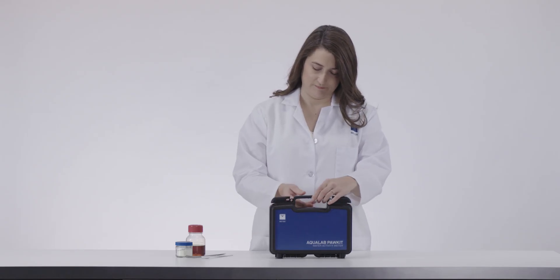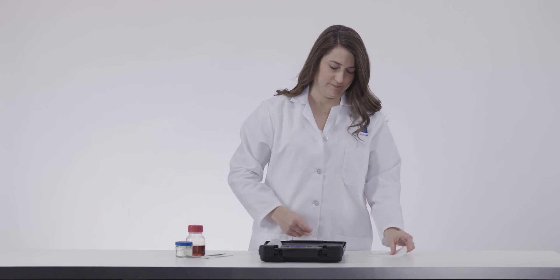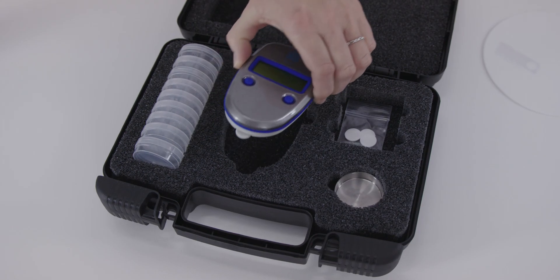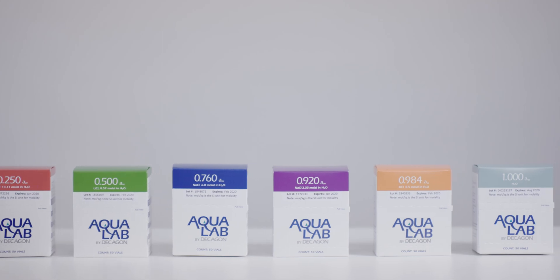If the sample chamber or sensors become contaminated, your pocket will not measure water activity correctly. The best way to check for contamination inside your instrument is by running verification standards each day you use your pocket.